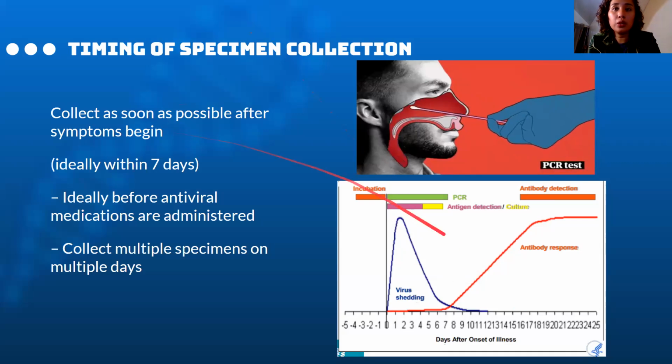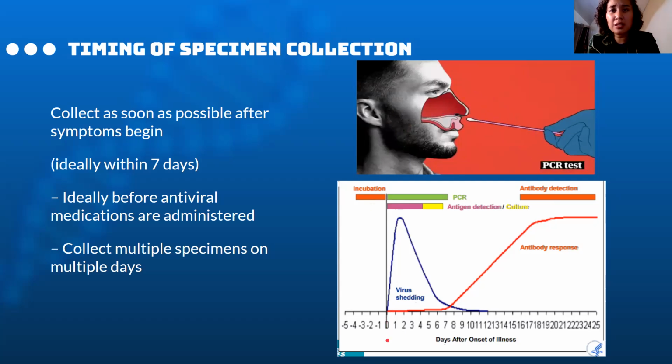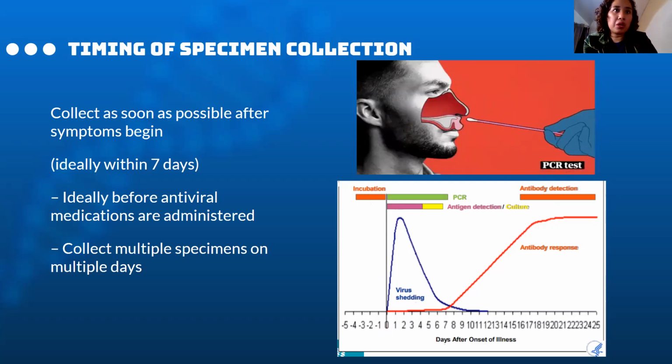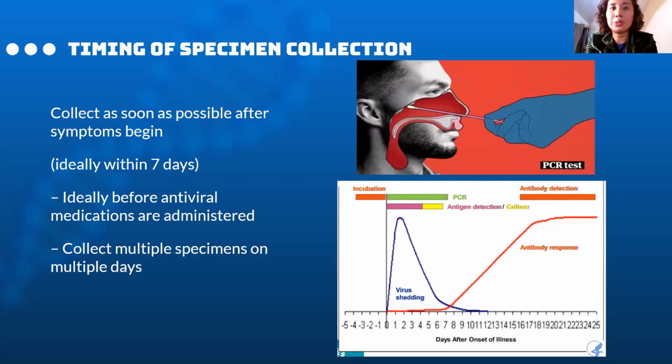Okay, so PCR, based on this image, during the incubation phase, hindi ka pa magpa-positive sa PCR on the first day of the symptoms. So, mahirap po yung asymptomatic. Okay, so collect as soon as possible after symptoms begin, within 7 days, and before antiviral medication, and collect multiple specimens on multiple days. That's the best.